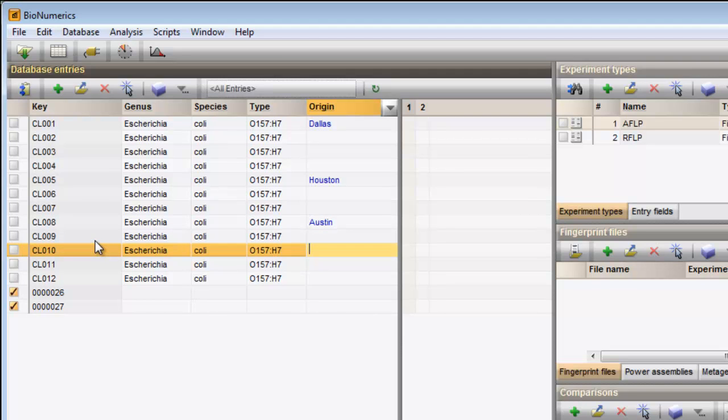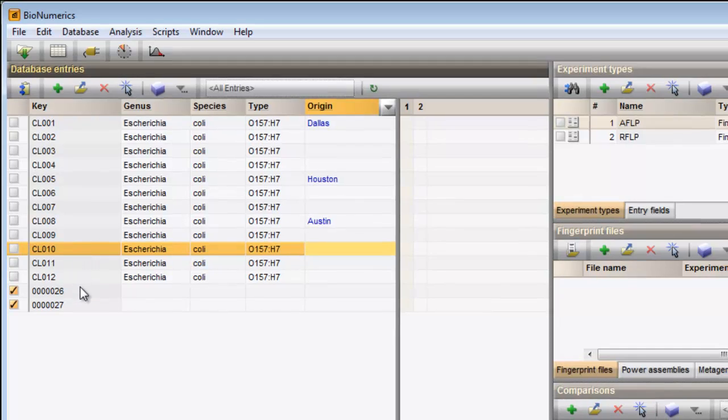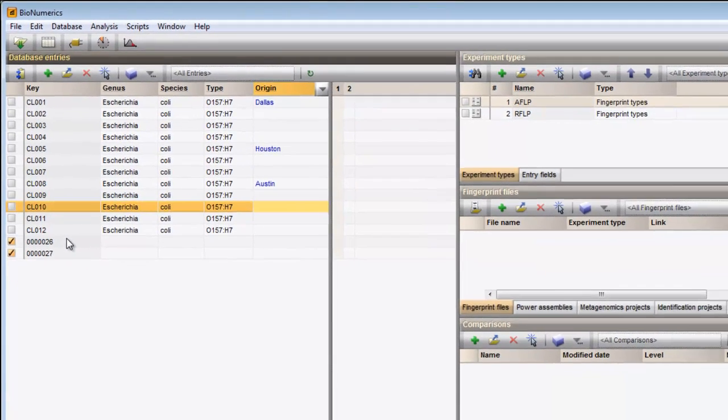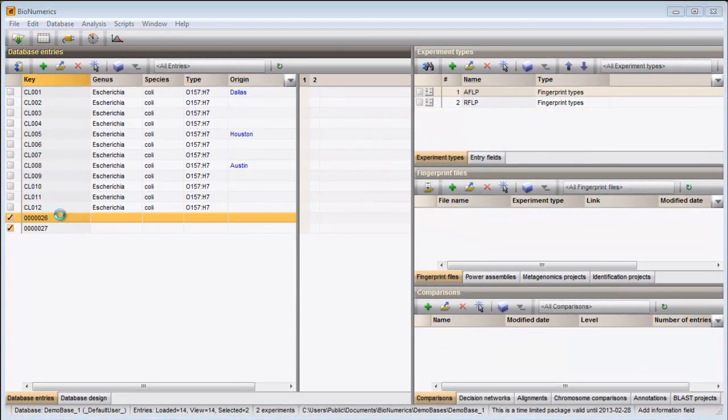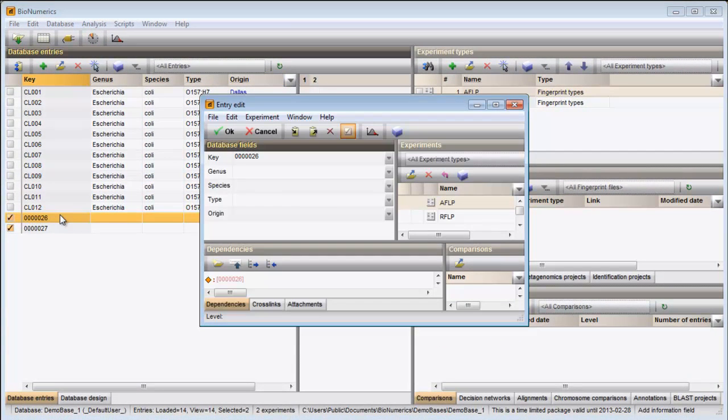Entering information can also be done in the Entry edit window. Double-click on an entry to open this window. As an example, I will change the key for this entry.